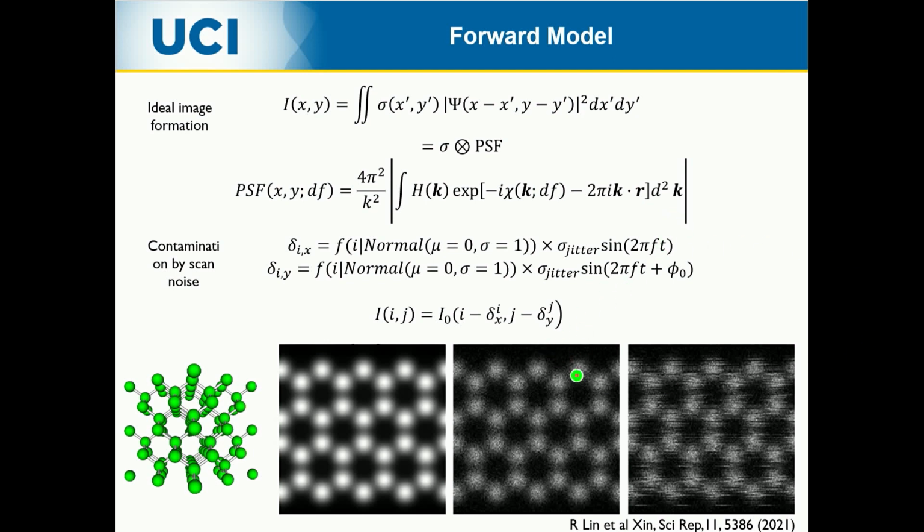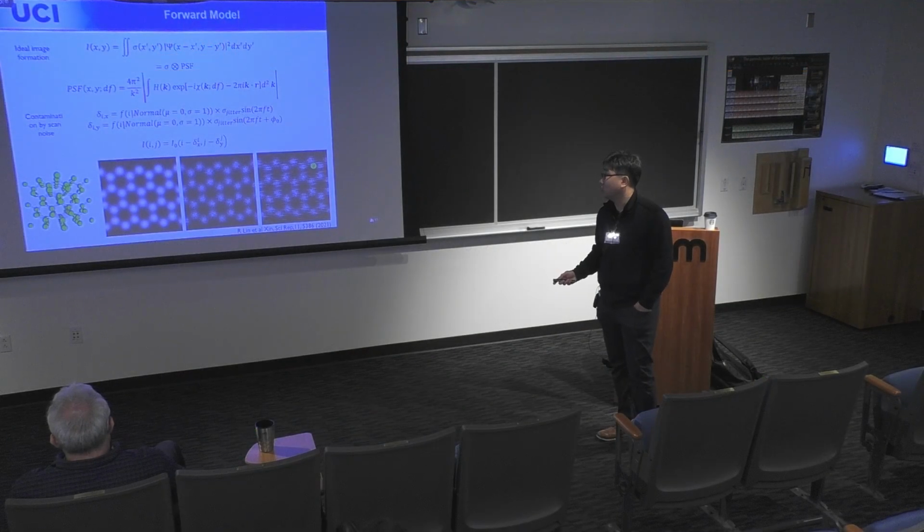And it's really the modeling of these tearing noises for STEM that's really, really important to improve the accuracy and robustness of a neural network, right? And think about other things that you need to model. This is really the noise is the thing that you need to do correctly, right?